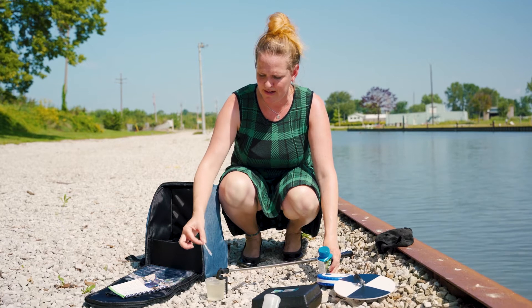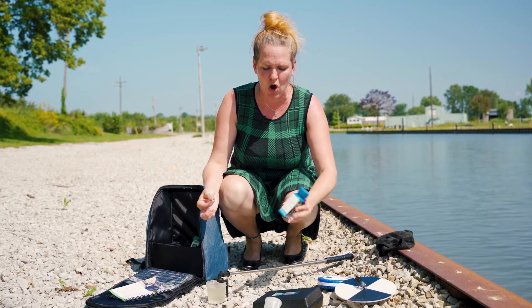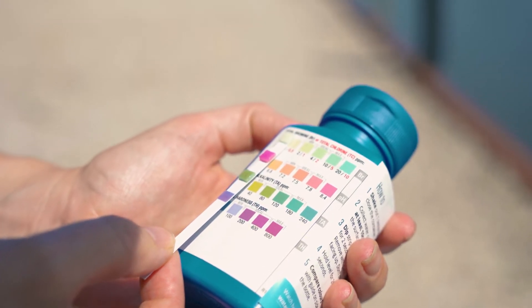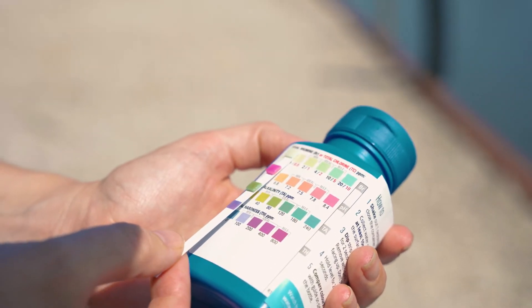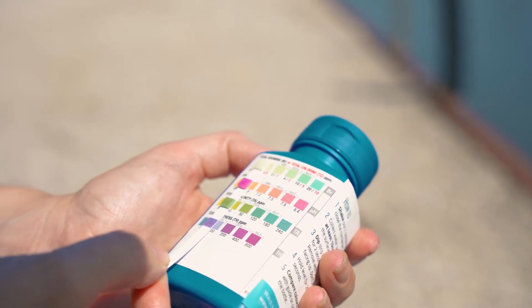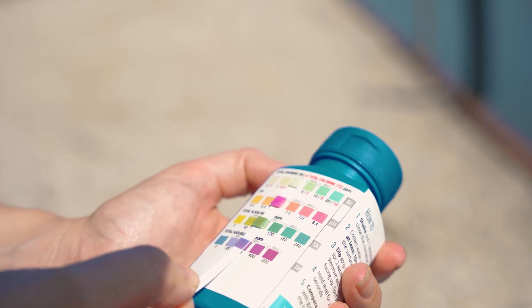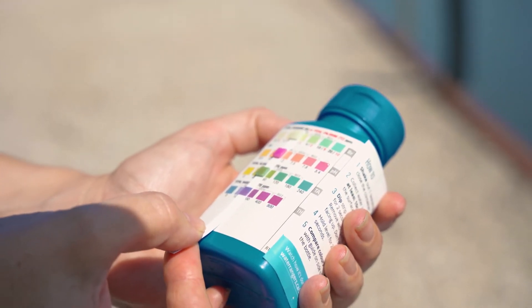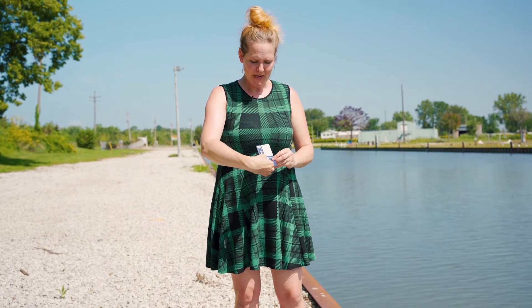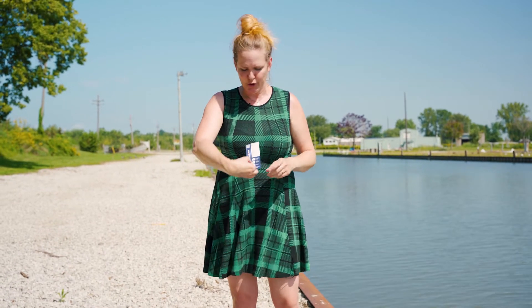Dip the strip in for two seconds, take it out, and wait 20 seconds, then compare the colors vertically on the back. Here we have a reading between 0 and 0.5 for chlorine, so we'd record 0.25. Our pH is at 8.4, our alkalinity is 80, and our hardness is between 100 and 200, so we'd record 150. Comparing colors can be hard — we're doing a study on machine learning to read your test strip with your phone. Lay your test strip on the little guide included in your goodie bag, take a photo, and participate in helping us improve strip reading.